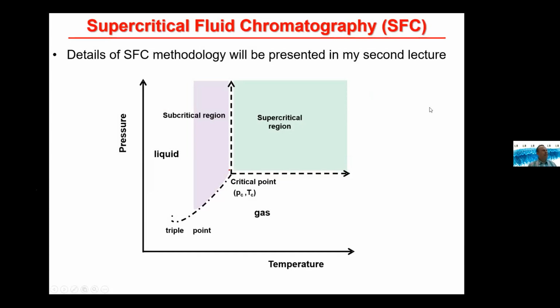Now, I would like to continue with supercritical fluid chromatography. This may be something relatively novel for many of you, especially the application in lipidomic analysis, but it's pretty natural to use this technique for lipids because it's well suited for molecules containing a large hydrophobic part. In this lecture, I'm not going into details because I have a separate lecture for this topic.